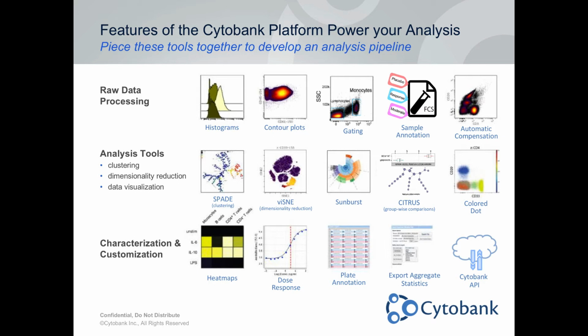Cytobank also contains other features that can help power your analysis in this bytes portion of your research cycle: the raw data processing tools, various analysis tools for clustering, dimensionality reduction, or data visualization, as well as characterization and customization tools. You'll see some of these throughout Richard and Shahram's presentation, and two of note, they'll talk about SPADE and viSNE and how they use those tools.